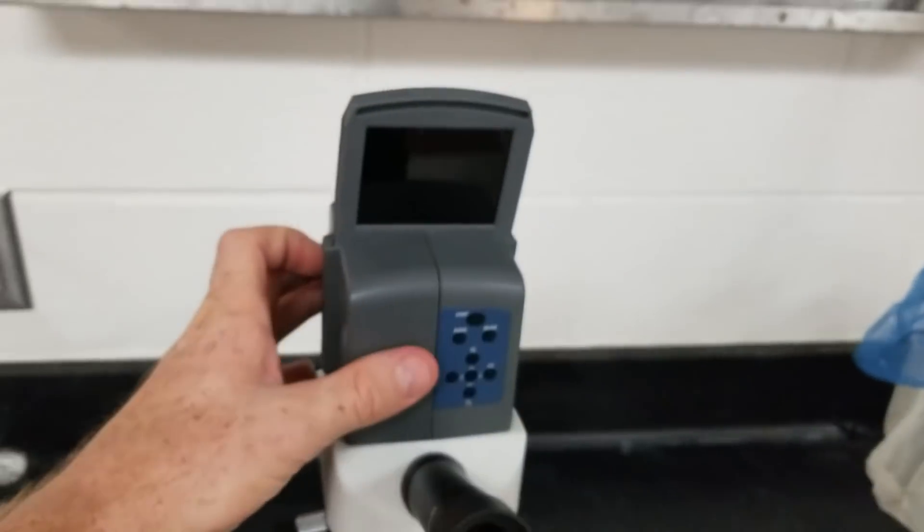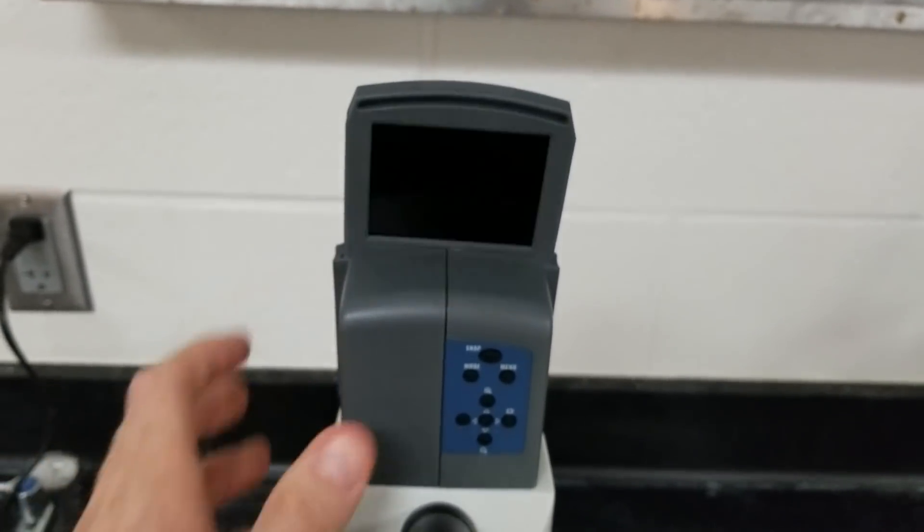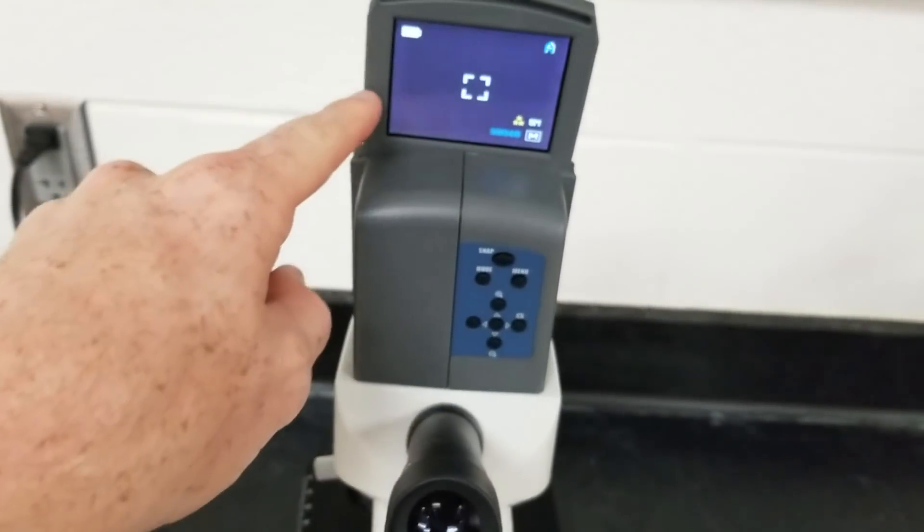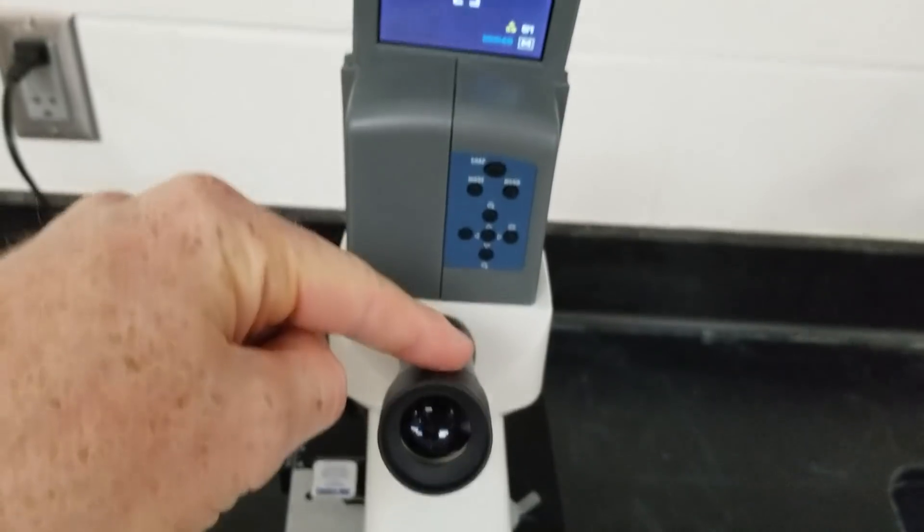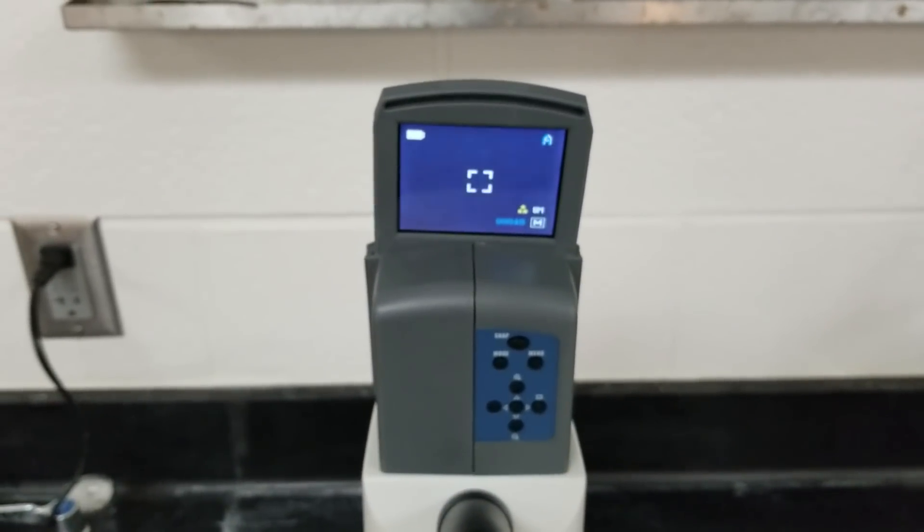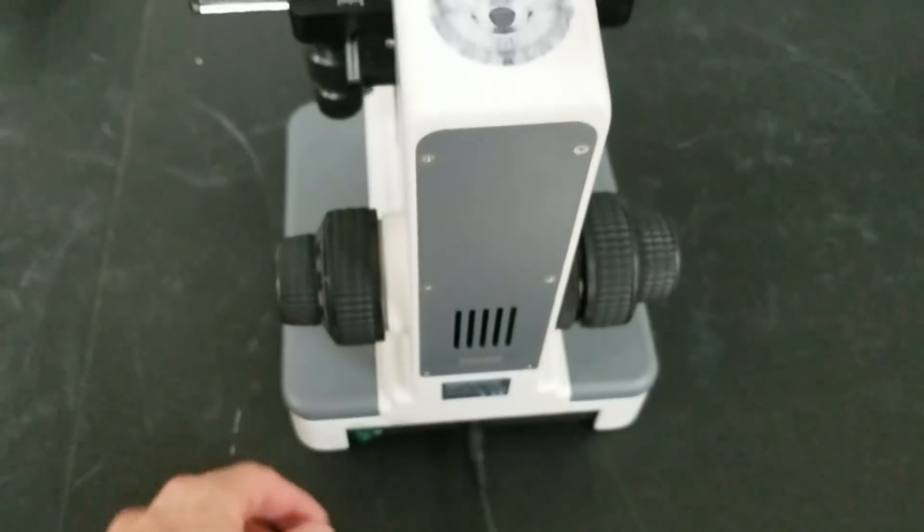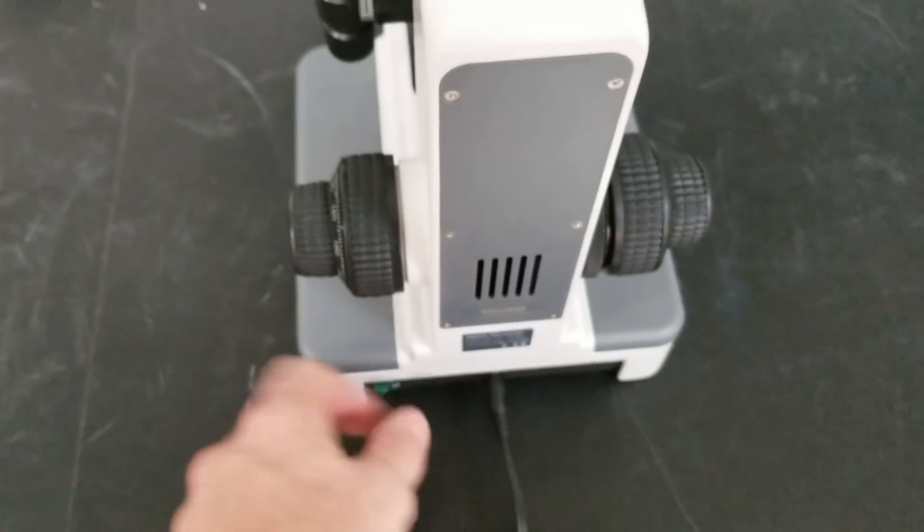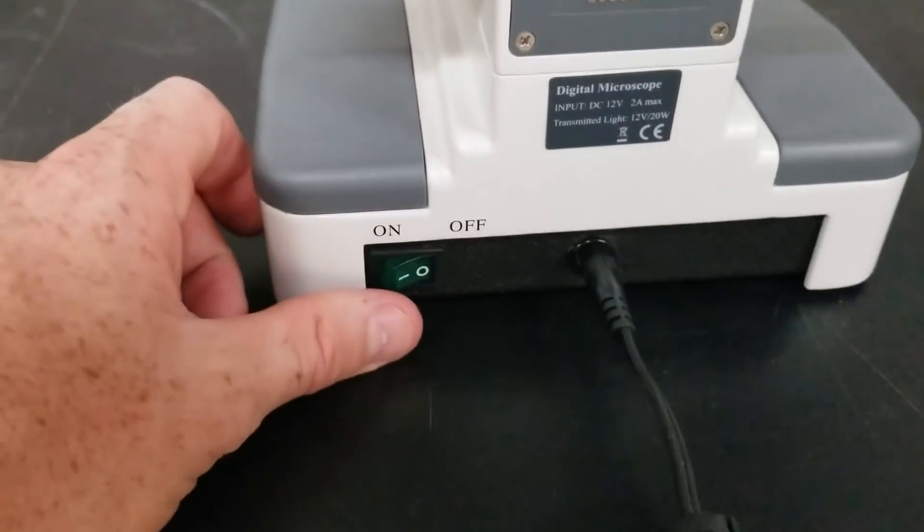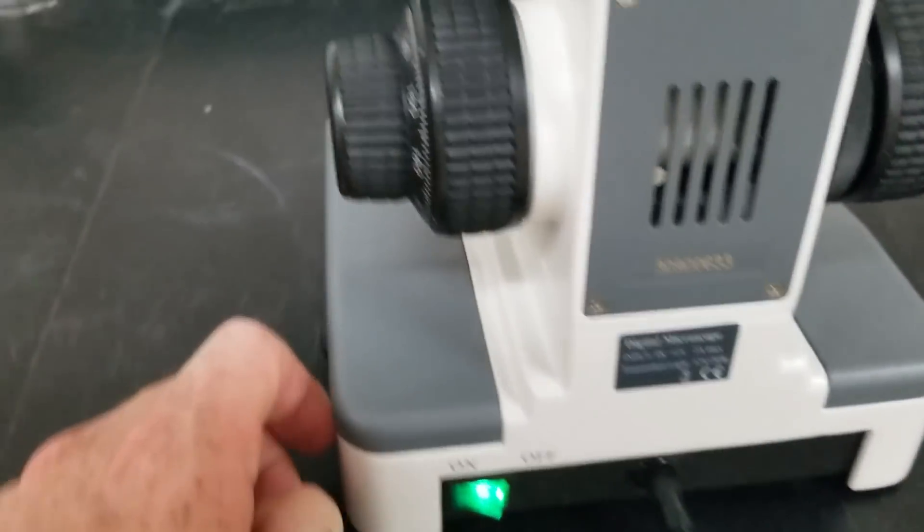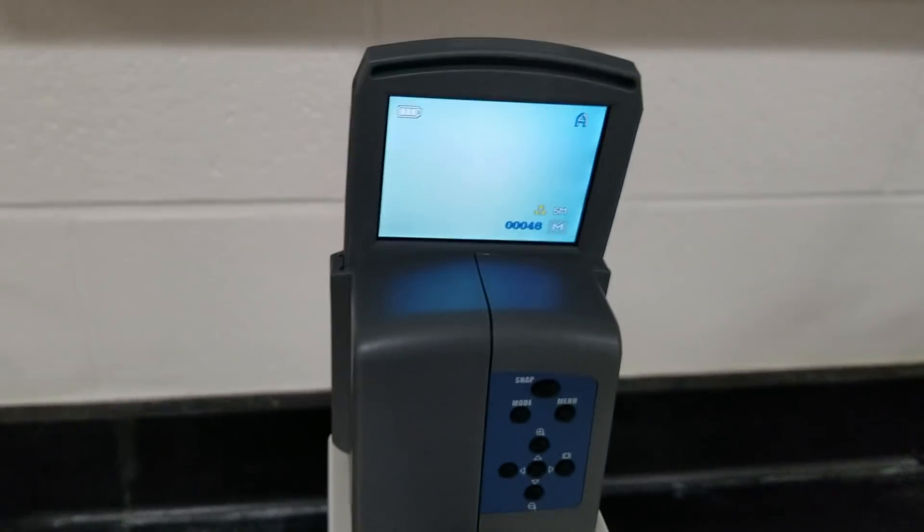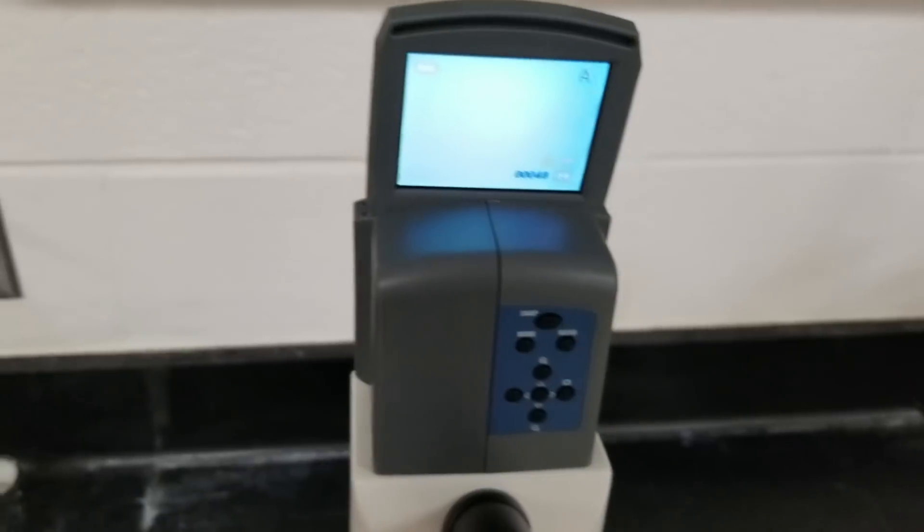Right now we're going to turn this screen on so it's easy. This is what you would see if you're looking in the eyepiece. You don't see anything. You have to make sure that it is either plugged in or has batteries and that the switch is flipped to on. This is going to turn the light on which then shows you the slide.